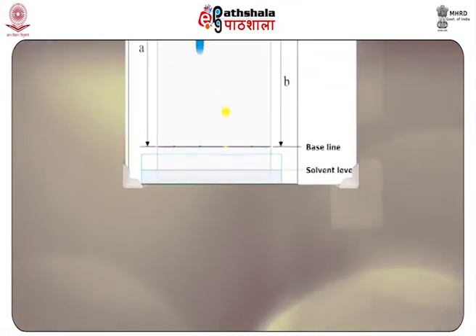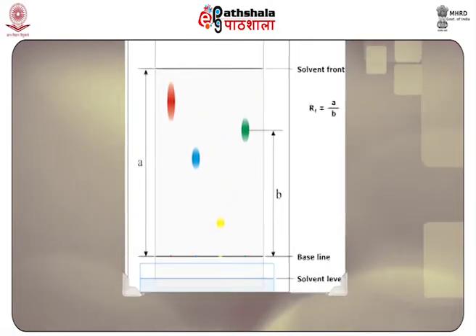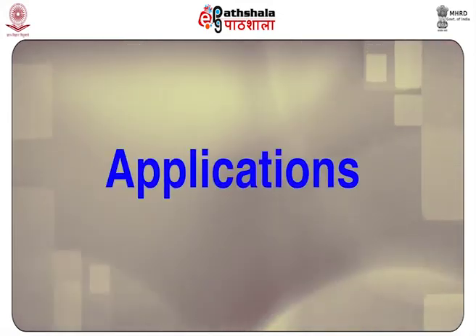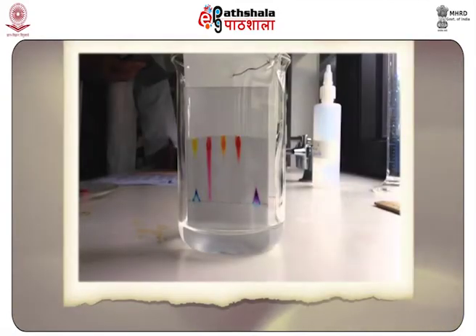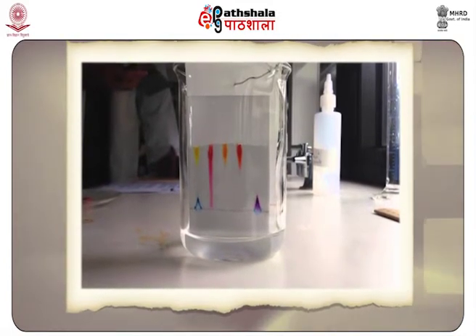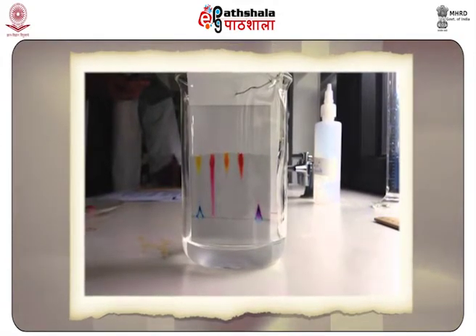RF value of each spot is obtained by dividing the distance traveled by a component by the distance traveled by the solvent front. These values are totally dependent on factors like nature of TLC plate, solvent used, etc. Now, about the applications. TLC can be used to monitor a reaction's progress, in identifying the different compounds of a mixture, and in determining a substance's purity.